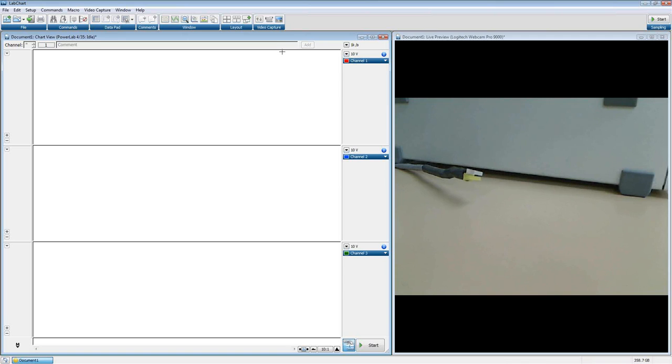So we developed Fast Response Output. As I said before, Fast Response Output is an extension you would download and enable in the Feature Manager. That's not built into LabChart. But what Fast Response Output does, everything that is used with it occurs in the PowerLab, so it's all hardware-based, so it's very, very fast. You can have response times with lags less than 1 millisecond with Fast Response Output, but it has to be an analog input, so like a raw data input to the front of the PowerLab.